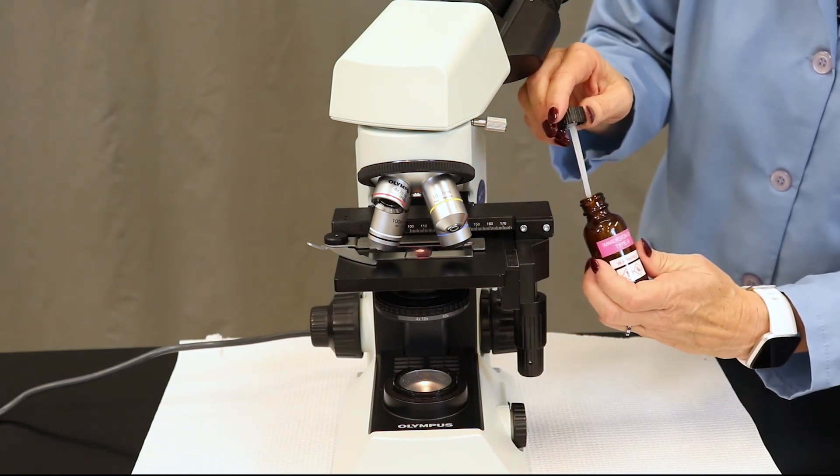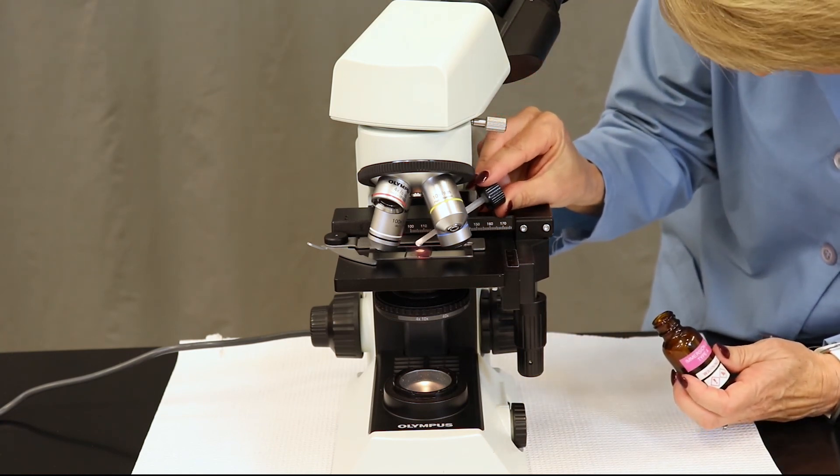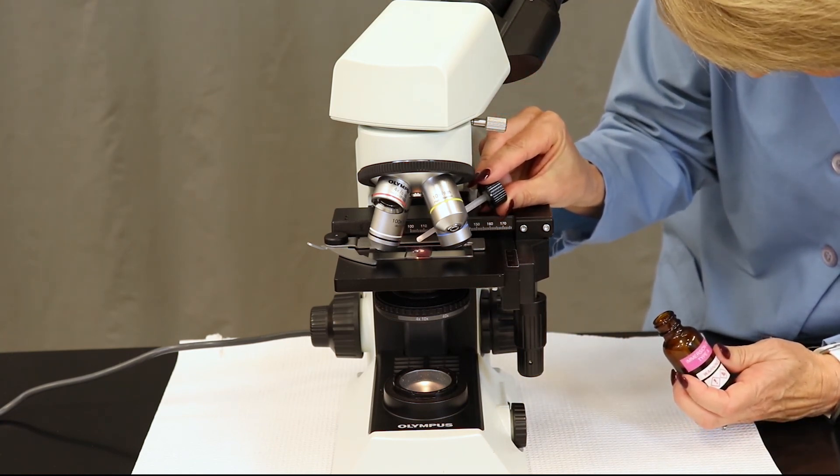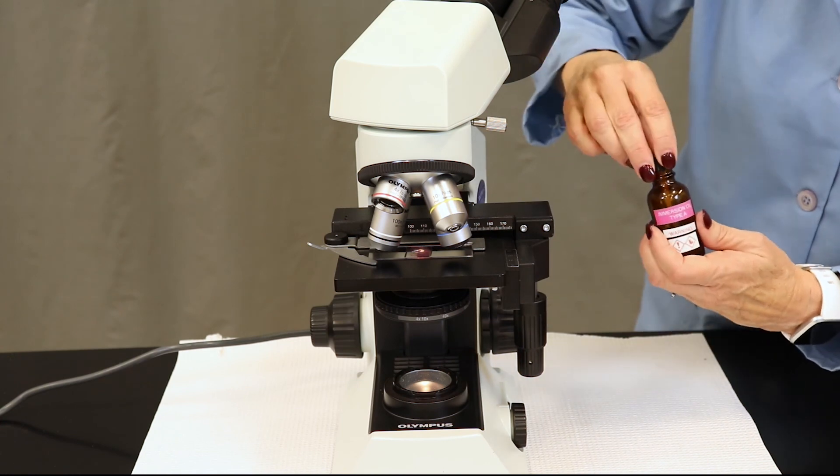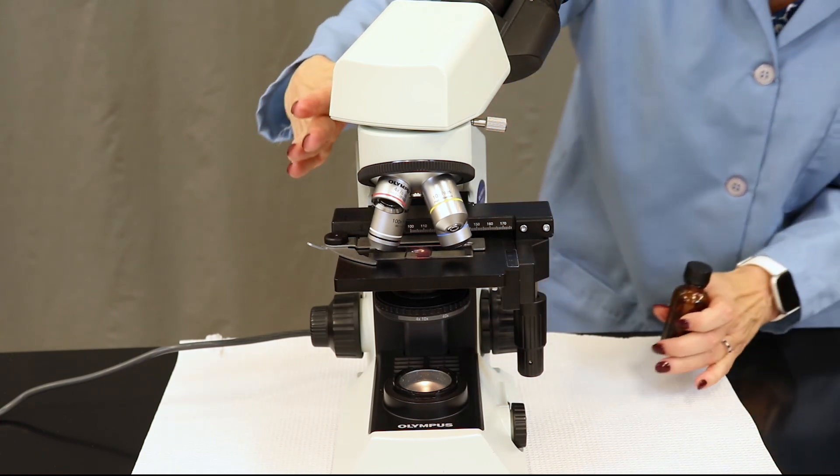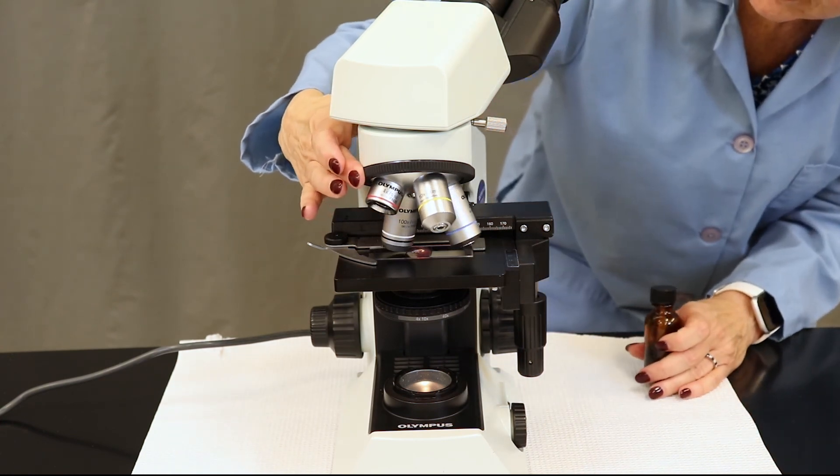You're now going to place a single drop of oil right over the glass slide, typically where you see the light shining through. Then place 100x into position.